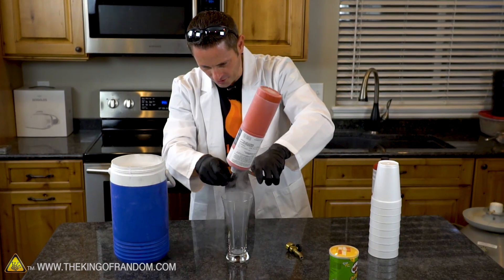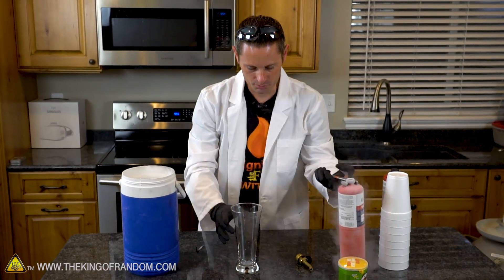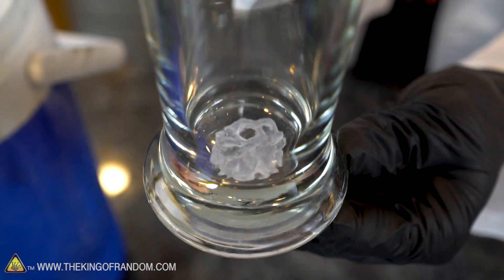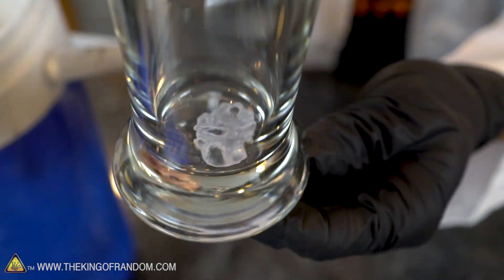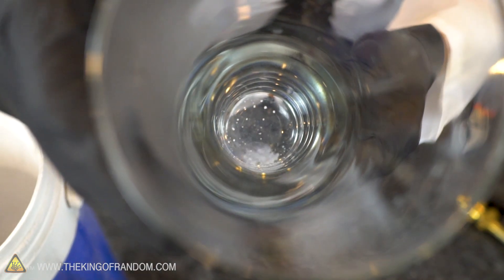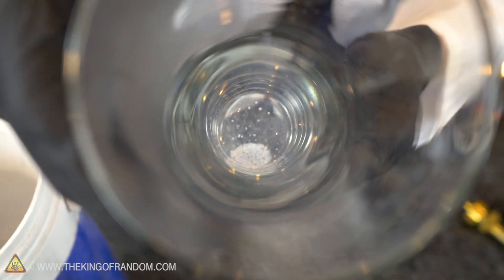We are in fact getting liquid oxygen - it's not much, but hold it up here maybe you could see it better. I think that's about all we're going to get - this bottle is completely empty now. But check it out, we did manage to get a little bit of liquid oxygen. Right down there in the bottom boiling away is a little bit of what I think is liquid oxygen. And it's gone.